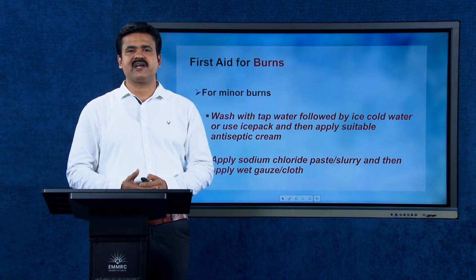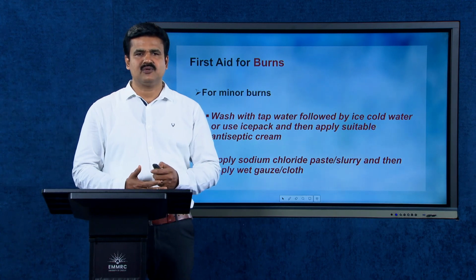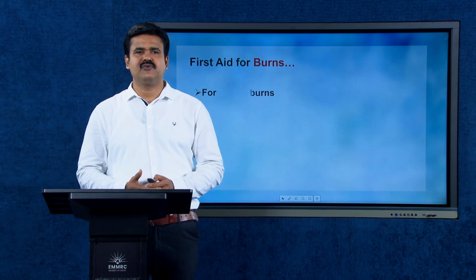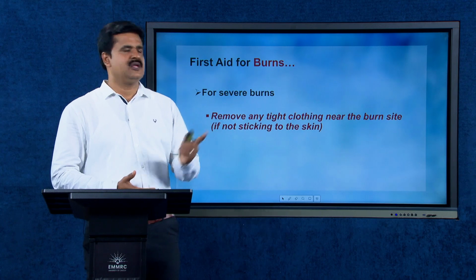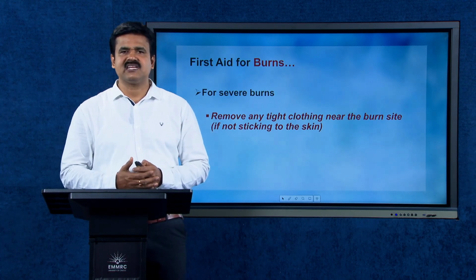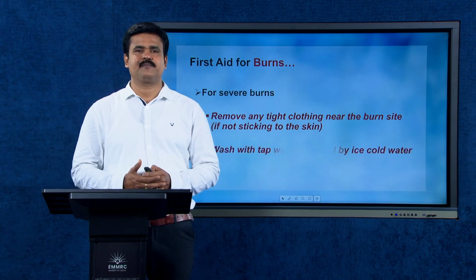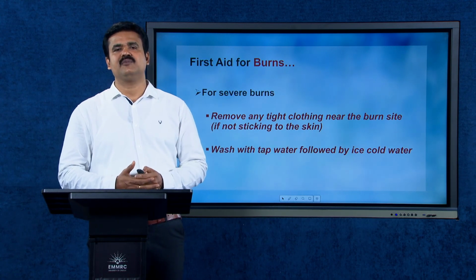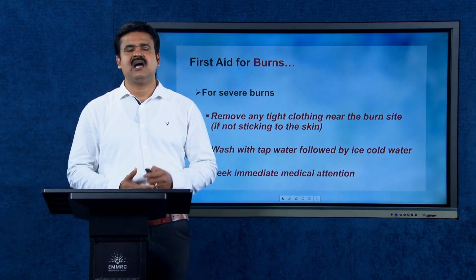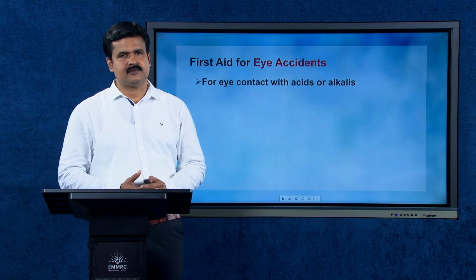Apply sodium chloride paste or slurry and then apply wet gauze or cloth. For severe burns, first remove any tight clothing near the burn site if not sticking to the skin. Wash with tap water followed by ice cold water, and finally seek immediate medical attention.